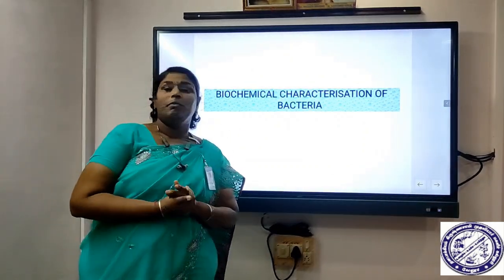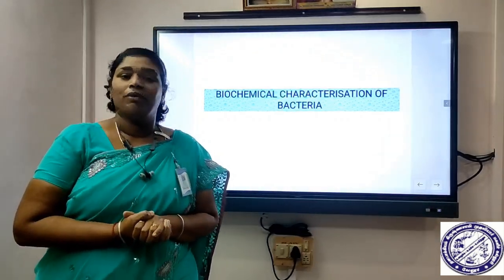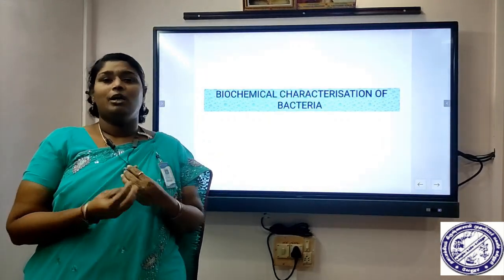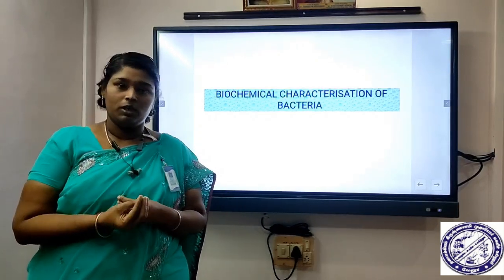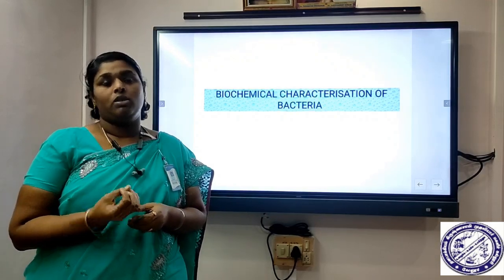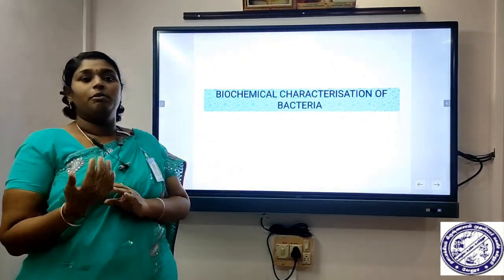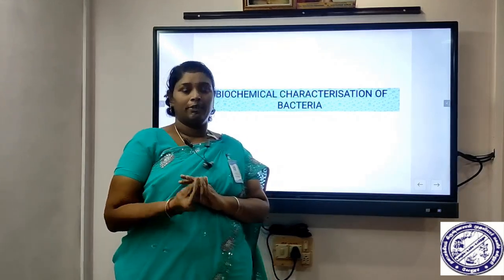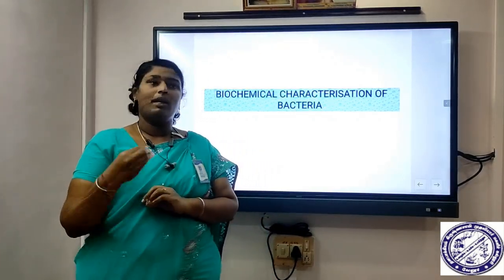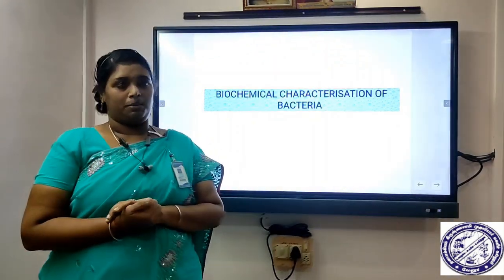So what is meant by a biochemical? Biochemical is nothing but a metabolic derivative of a living cell. Each and every cell will be doing the metabolism. So from that metabolism they will be getting energy products. That product is said to be the biochemicals. With those biochemicals, they will be doing all their energy activities as well as their reproductive activities, and every mechanism will be done with the help of the biochemical substances.